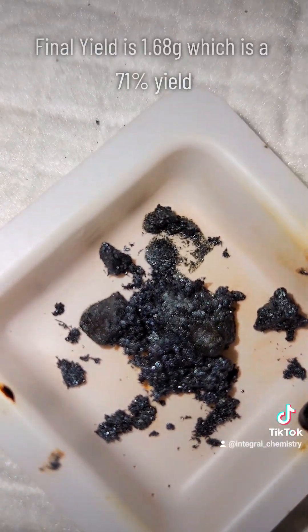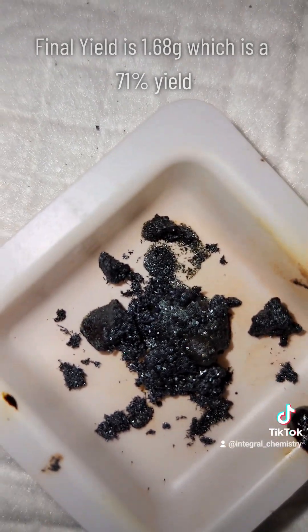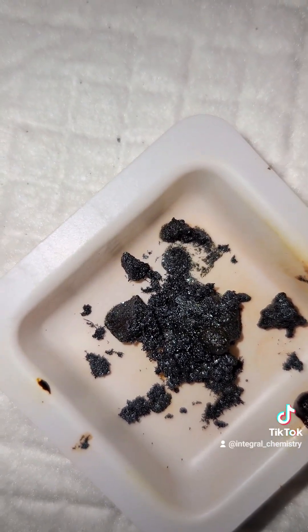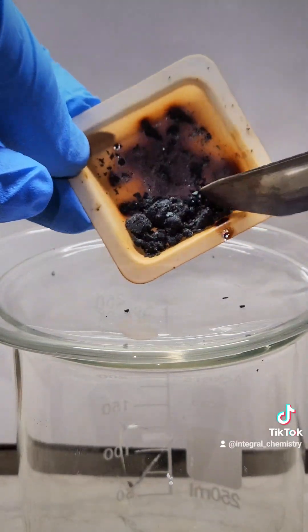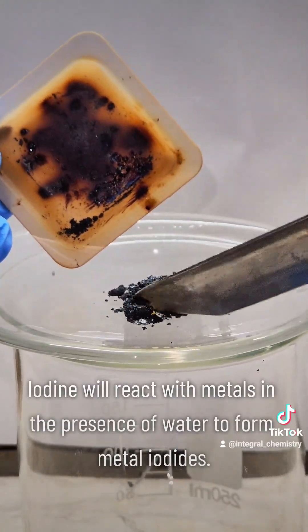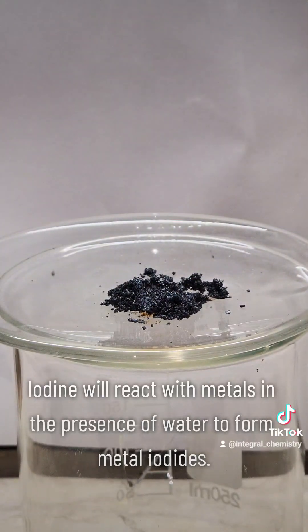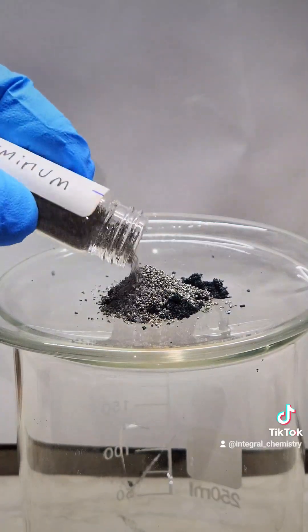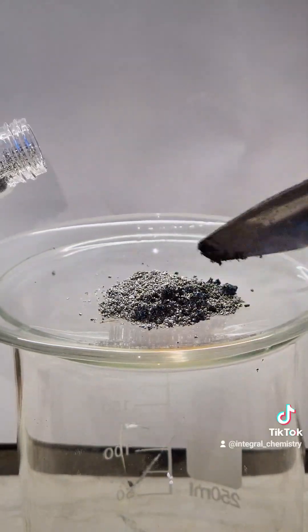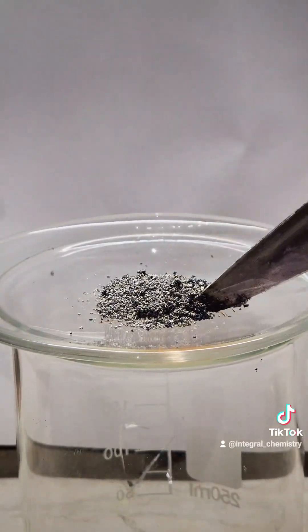After doing this process twice, I'm left with 1.68 grams of pure elemental iodine, which represents a 71% yield. I think this yield is pretty good for the process, but in general you're better off just buying iodine if you're able to. This process was pretty expensive and lengthy, and I really only did it for fun. One fun little thing I'd like to show is how iodine can react directly with metals in the presence of water to form metal iodides. This is a highly exothermic reaction that's very similar to thermite, and the heat it produces will actually burn off some of the elemental iodine left over.